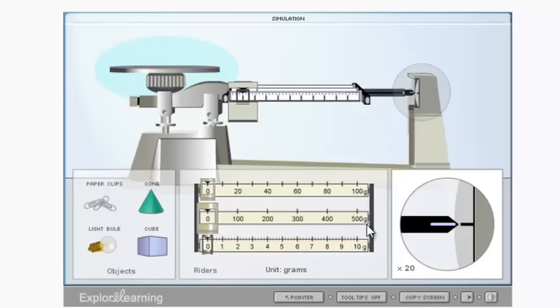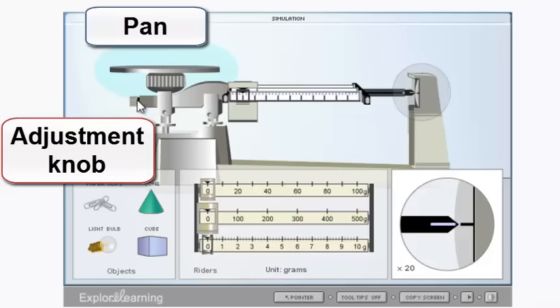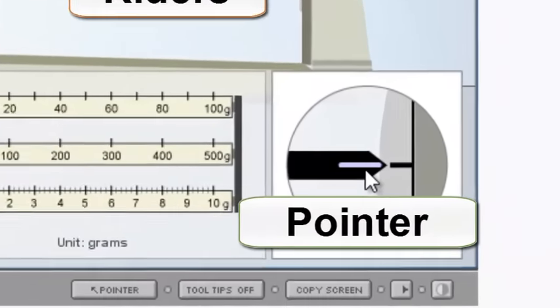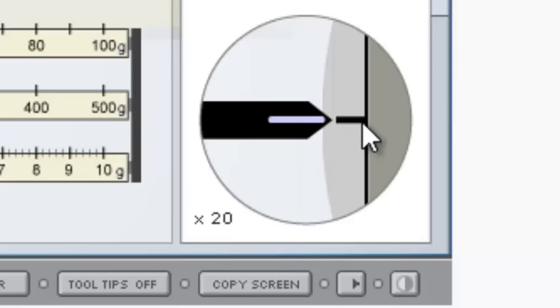Now the triple beam balance has certain parts to it. You have what's called the pan, which is where you place the object that you're massing. You have the adjustment knob, which is the knob that you turn to try to balance this out before you get started. You have your triple beams or your riders, and you have three different types of riders: the 100 grams rider, the 10 grams rider, and the 1 grams rider. Those are basically named after how many grams they go up. And then you have the pointer here. The pointer is the thing you are going to look at to make sure you have it balanced. The goal of using a triple beam balance is making sure that this pointer in this line lines up with that line so you're balancing it out.